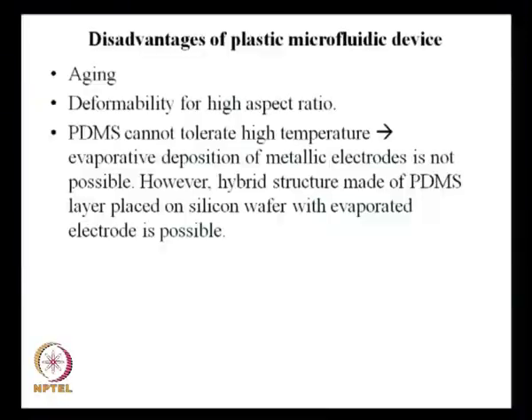And the other issue is deformability for high aspect ratio. I said one advantage you get is elastomeric quality, that it can stretch and bend, but the same thing would be a disadvantage when you are working with high aspect ratio.